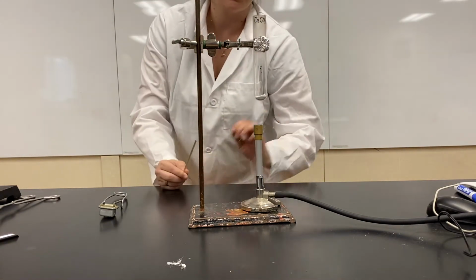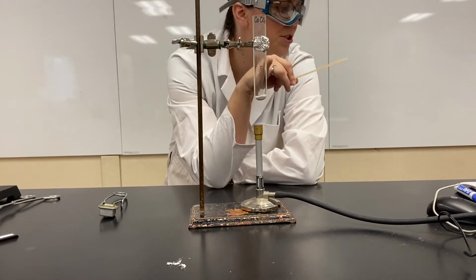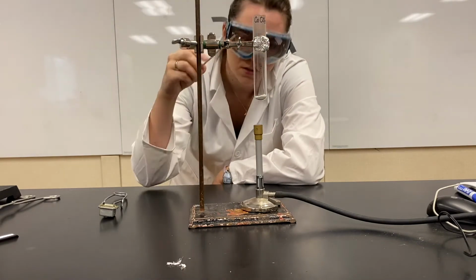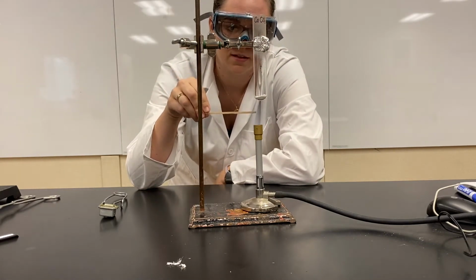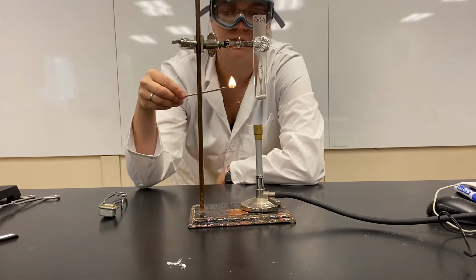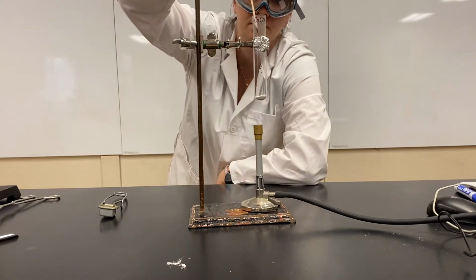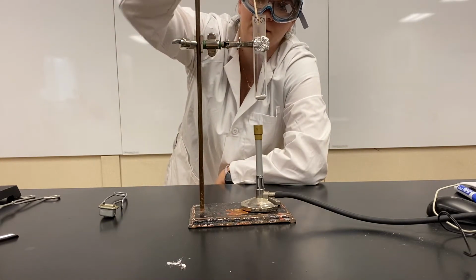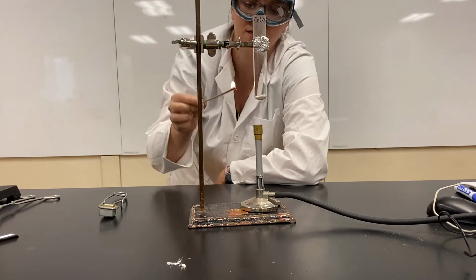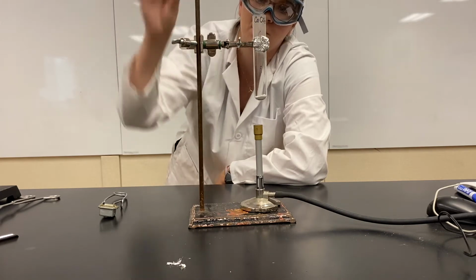And then to check and see what's happening with this decomposition reaction, I should be getting some carbon dioxide forming out of this reaction. So what I'm gonna do is I'm gonna light this on fire, and the fire should go out if I put it inside the test tube because it should be filled with carbon dioxide, okay? Ooh, exciting, right? Because fire needs oxygen to survive, and since it's making carbon dioxide, fire goes out immediately, okay?